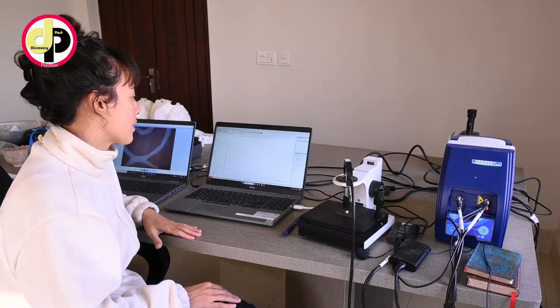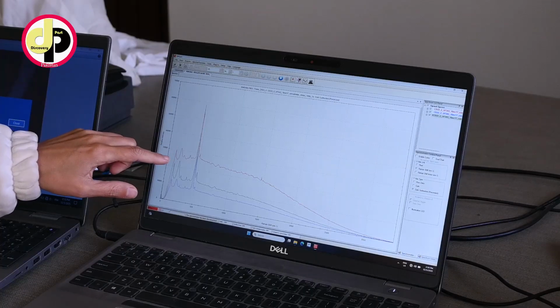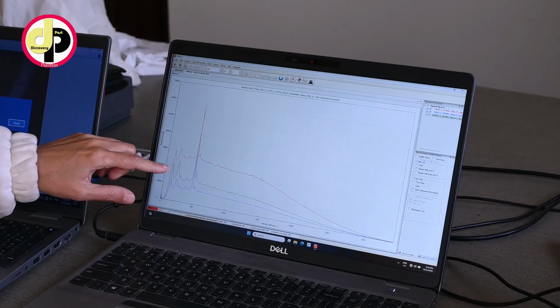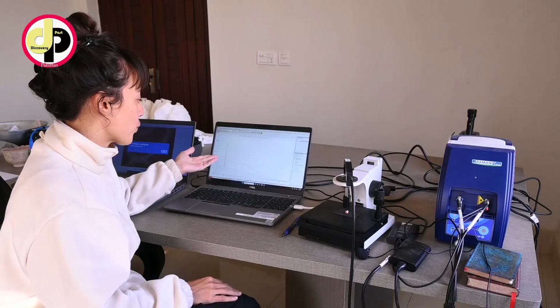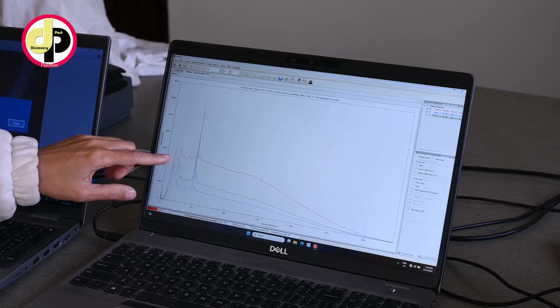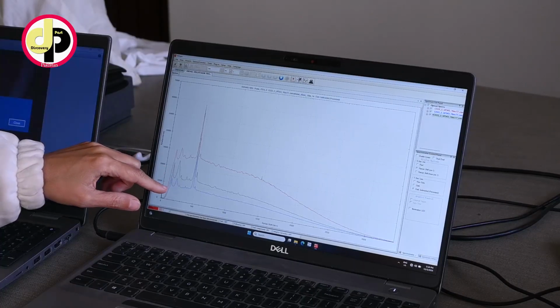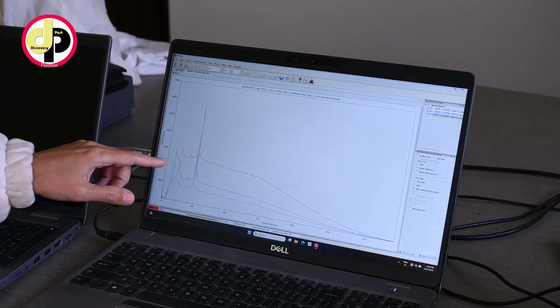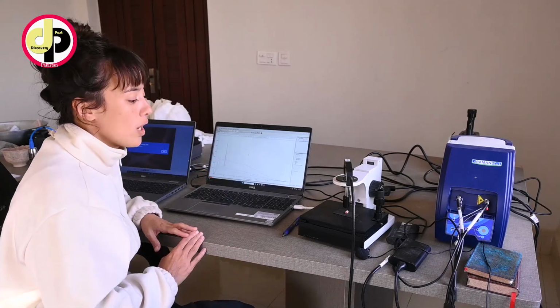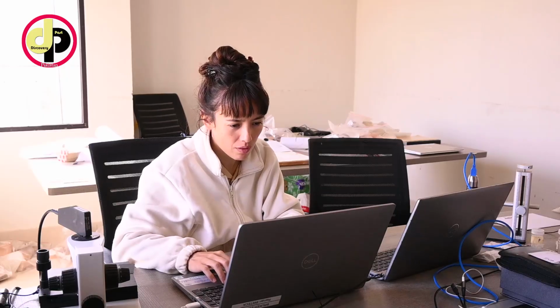Thanks to that, we can record some spectra, where we can see some specific bands, and I will have to compare those spectra coming from the material with a database in order to identify, for each peak, what kind of vibration in the molecule it corresponds to, and like that I will know the composition of the material.